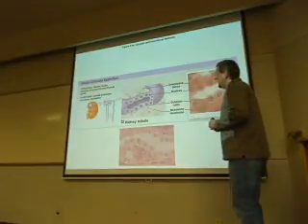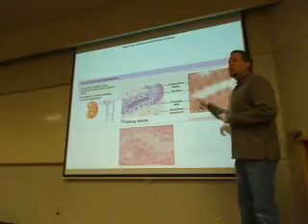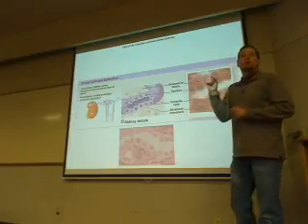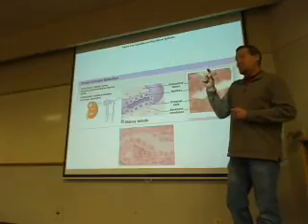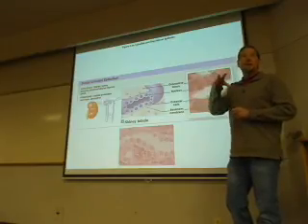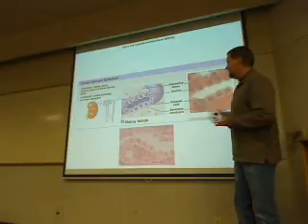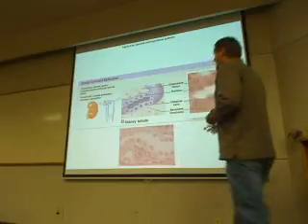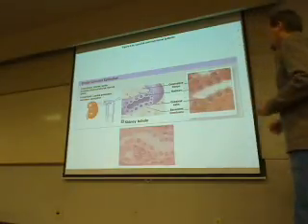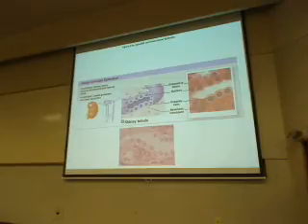When you talk about these guys in 233, interestingly enough, we're going to talk about tall cuboidal cells and short cuboidal cells. And so they're actually going to be basically cubes, but one group of cells are taller than the other one, so they decided to call them tall cubes and short cubes. And so even though they're cubes, we're going to differentiate there also. And so they're showing you glands, ducts, portions of the kidney, tubules, thyroid gland, all good places for these guys.